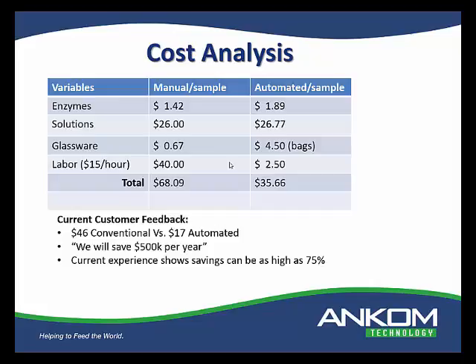But when it comes to TDF, the upper bag is what we call a flow-through bag. And perhaps counterproductive from a company that has the consumable, we tell people right up front that the flow-through bag, because it does not go through a protein or an ash process, is a bag that can be used more than once. I was recently in Thailand, and we're using them 4 times.